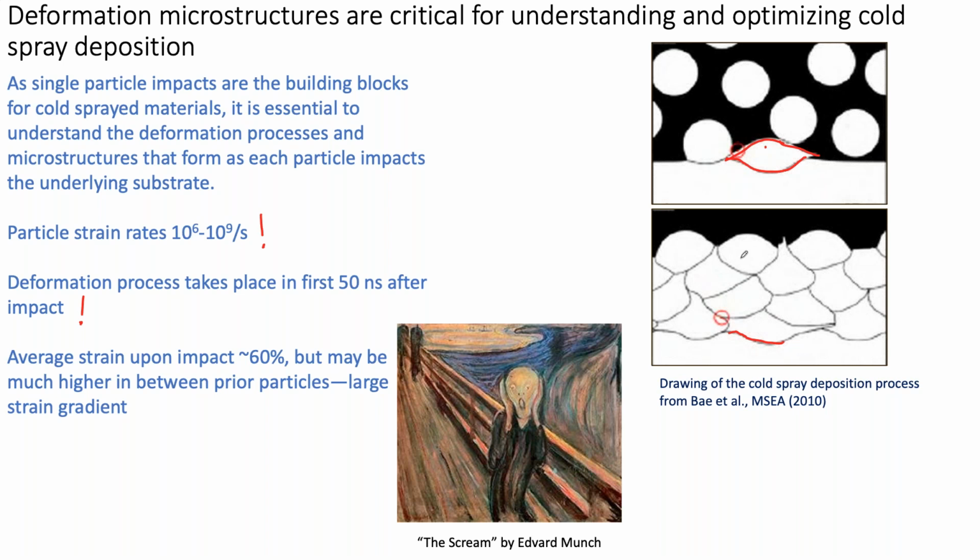So on the average, if each one of these is, say, 20 microns going this way, that'd be about 80 microns. And if it's less than that, you'll start to have problems with coverage, right? It becomes a statistics problem at that point. So I would say rule of thumb, trying to dip below about 100, 150 microns is going to start to cause property issues, but you should be able to get down to 100, 150 microns fairly easily.